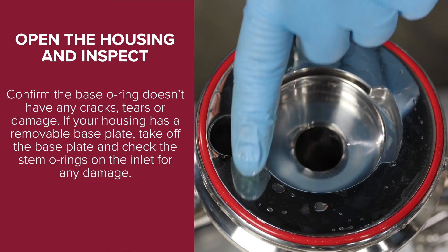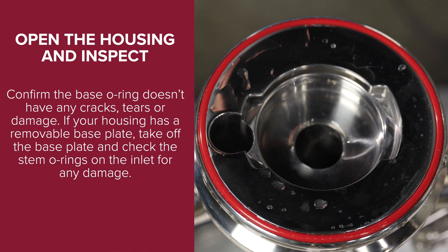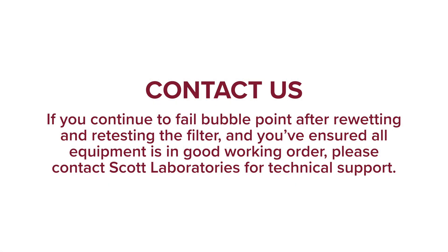Confirm the base O-ring doesn't have any cracks, tears, or damage. If your housing has a removable base plate, take off the base plate and check the stem O-rings on the inlet for any damage. If you continue to fail the bubble point test after re-wetting, re-testing, and ensuring all equipment is in good working order, please contact Scott Laboratories for technical support.